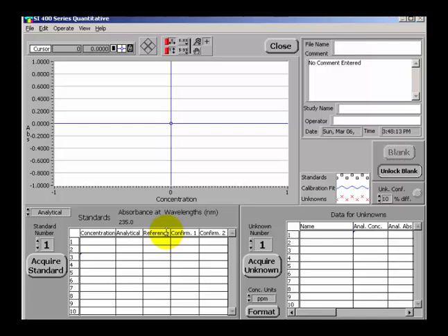This is extremely useful for samples that may contain inherent turbidity, color, or have dissolved oxygen that may diffract light. Any of these interferences can cause errors in analysis by reducing the transmission of light.